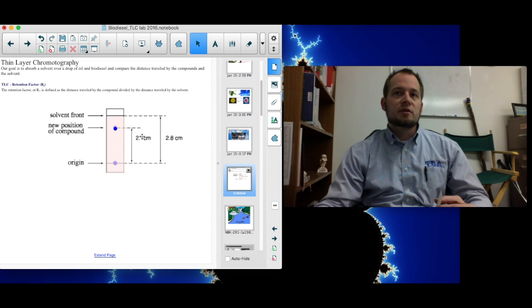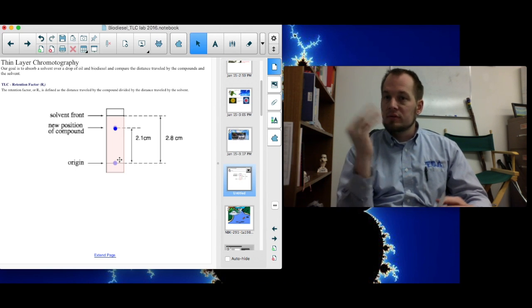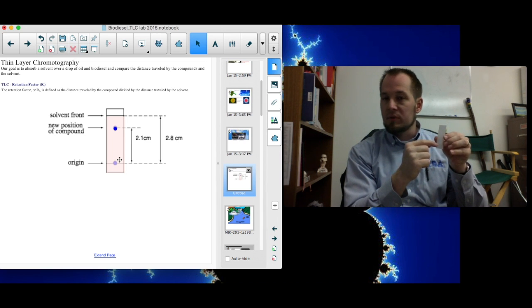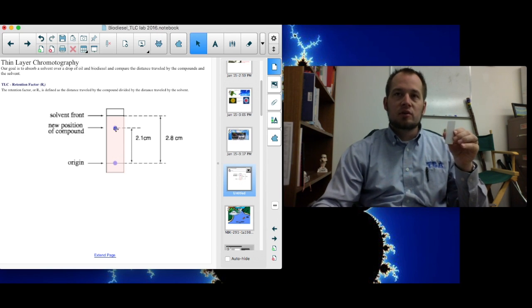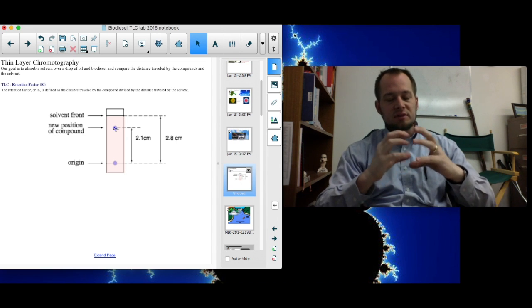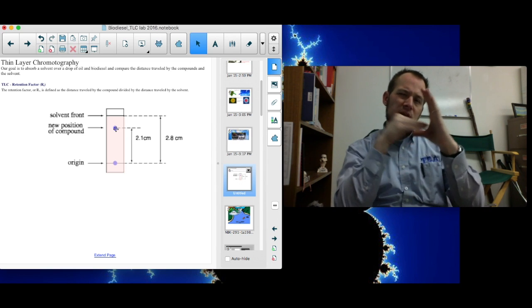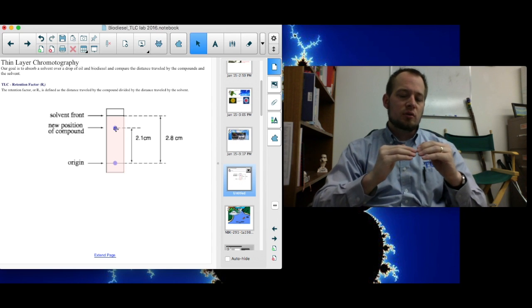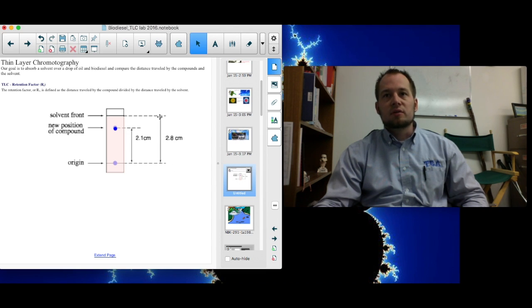Now, you see a couple of measurements here. These are important measurements. This spot traveled 2.1 centimeters in this case. The place you measure the spot from, this is very important, is the center of the spot. When you put it on at the bottom, you can see it's centered on that bottom origin line. And then as it moves up, you measure to the middle of that spot. Sometimes spots don't stay as nice little circles. Sometimes they spread out into ovals, or they change their shapes. So you have to try to get to the middle of where that spot would have been. You don't want the very top of the spot or the bottom of the spot. You want the middle. The other measurement on here is how far the solvent itself moved. In this case, 2.8 centimeters.